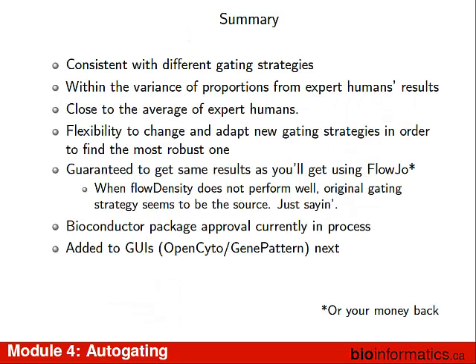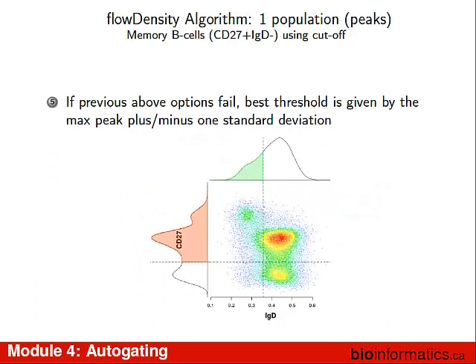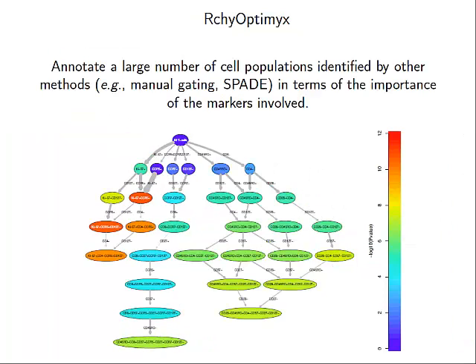Question: can you make sure I understand this better, that the figures are talking about the cellular hierarchy concepts? Yeah. So you have the thickness of the gray arrows between the different populations, and then you have the color tone describing the p-values. Okay, so just on the side, let's confirm that the red color indicates a high significance? Yeah.